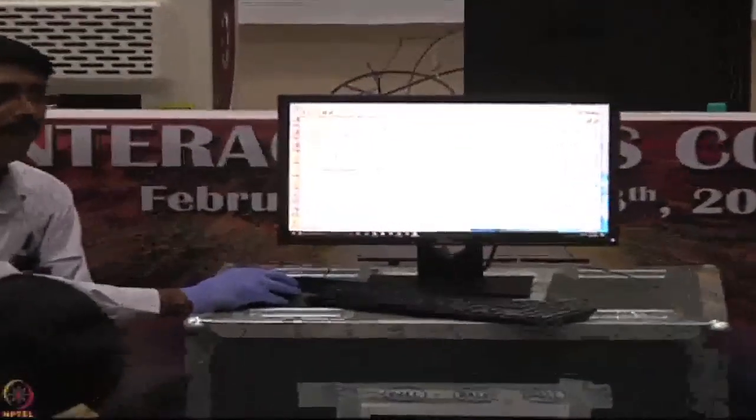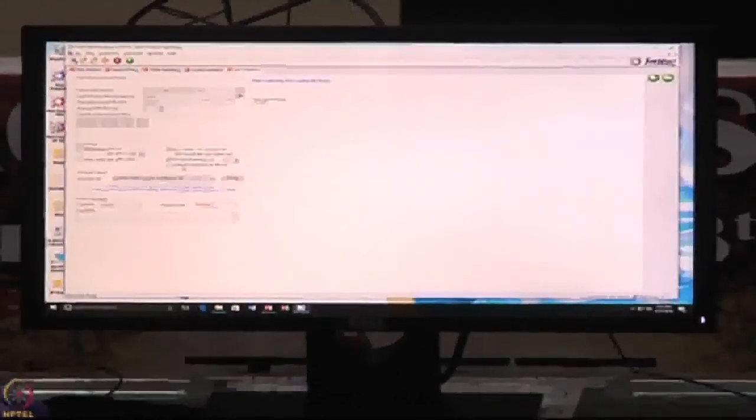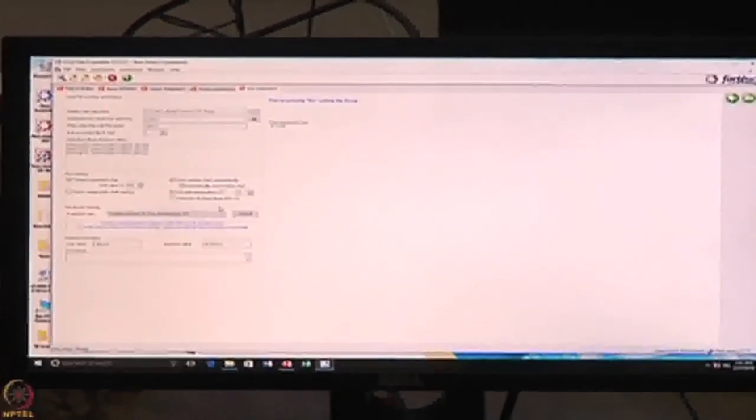Then you can mention the plate temperature. You can work from 15 degrees to 40 degrees. Now it is around room temperature, 23 degrees. Even after the experiment, do you want to hold the temperature back at 23? Yes, you can. Click it, not a problem. So this is what we have done, the experiment plus the setup, you can say. Then we can say start go.